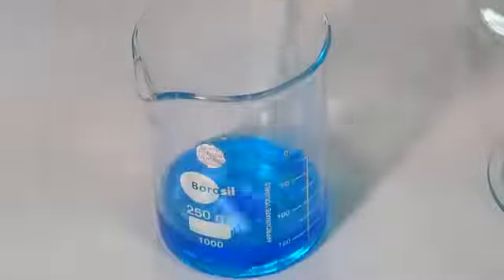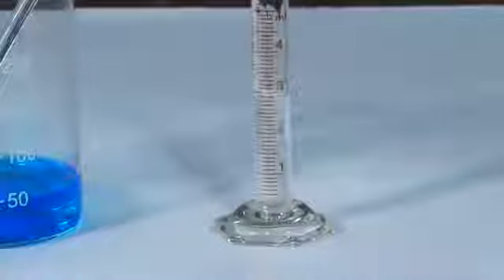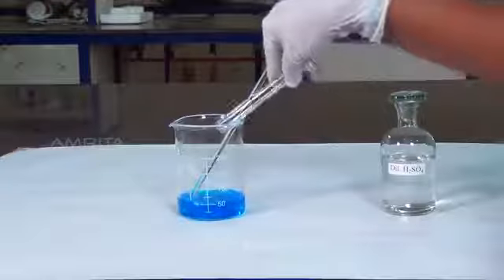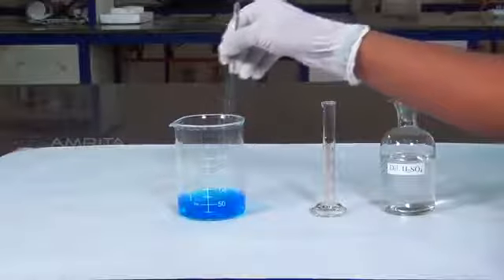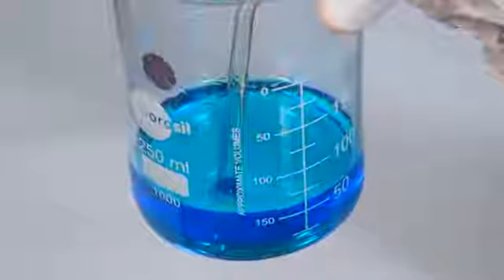stirred for some time. Now, add about 3 ml of dilute sulfuric acid to the solution using the measuring jar and gently stir the solution to make it clear. This prevents the hydrolysis of copper sulfate.